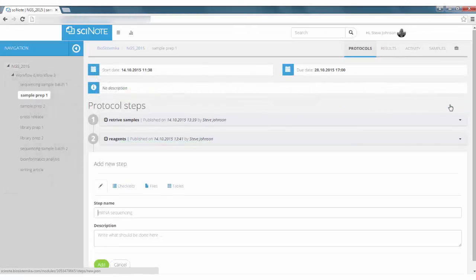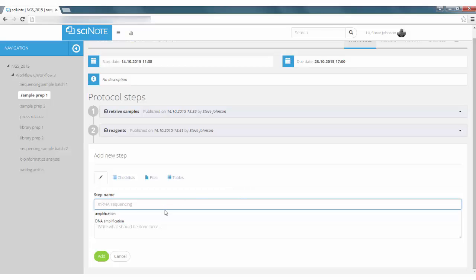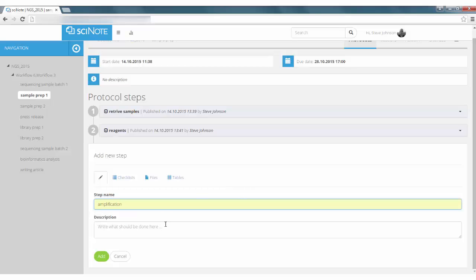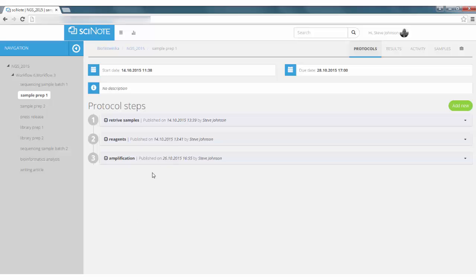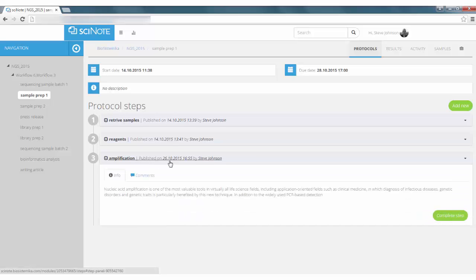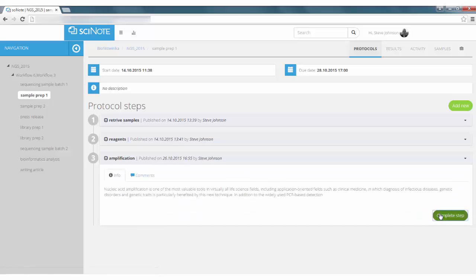In a module, you can create steps of a protocol. Each step can be marked when completed so you will know exactly when it was done.